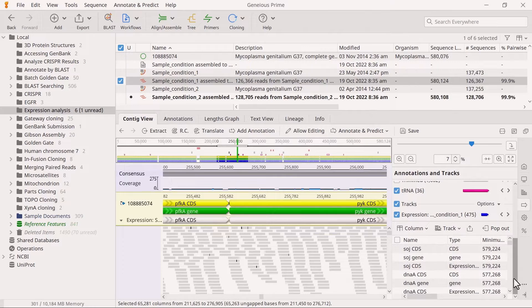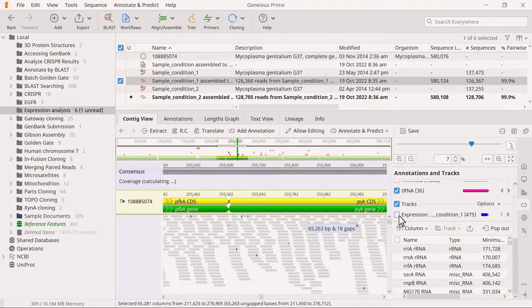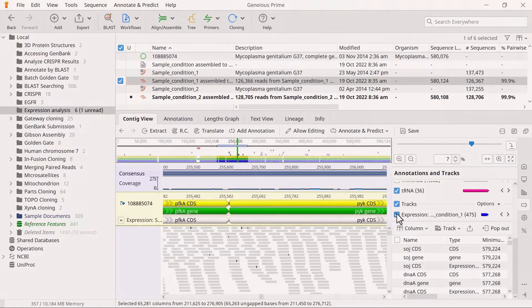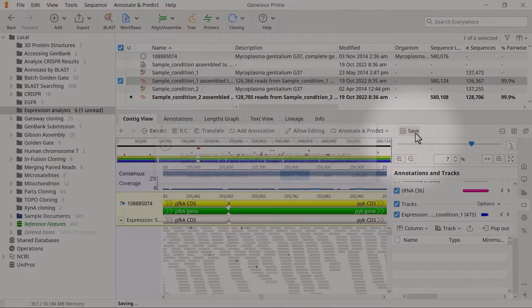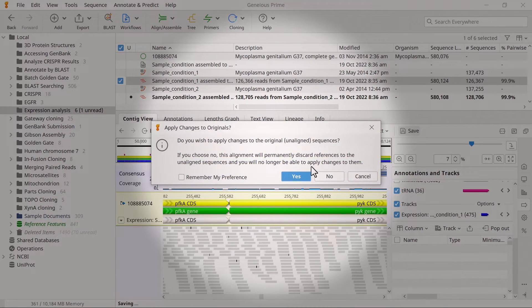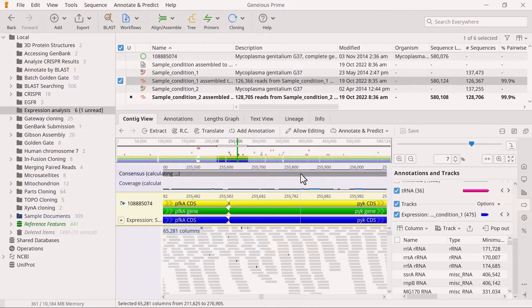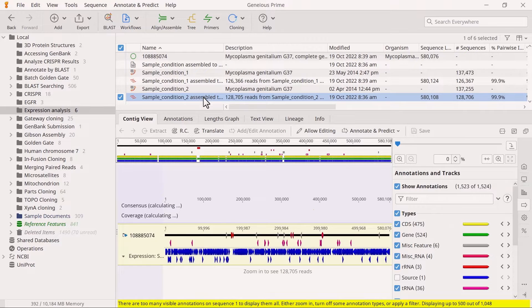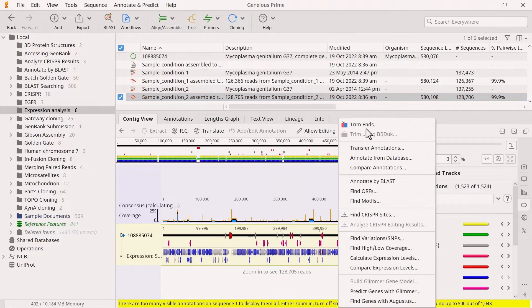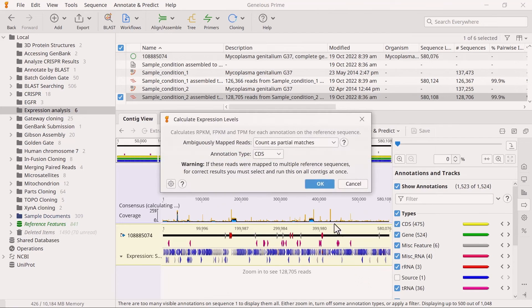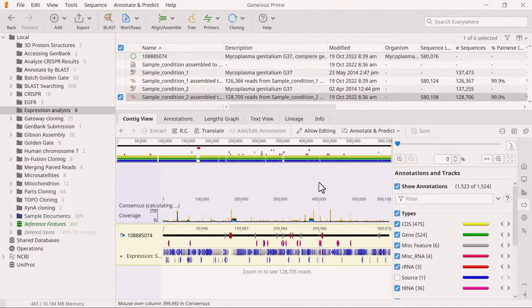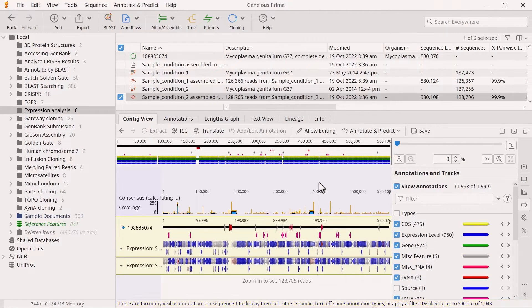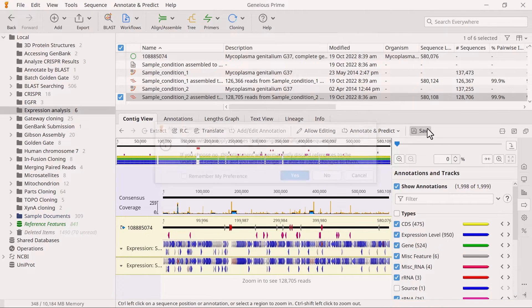You should now see a new track created on the reference in the assembly file. Click Save to save your changes, and when prompted, choose to apply the changes to the original sequence. Because my two assemblies represent different experimental sample conditions, I need to run the Calculate Expression Levels analysis separately for the other sample. If you select both assemblies and run the analysis on both at once, Genius will assume that these are a single sample.